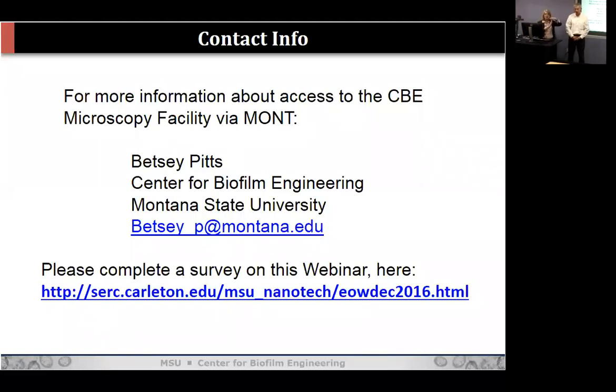Yes, absolutely. We have glycerin, oil, and water. In the inverted, they don't go right into the... No. Gravity always works that way. But we use such a tiny amount, everything is kind of a balancing act. So you don't have too much time to go in the Z direction? You do, you have quite a while. It depends on the medium. With oil or glycerin, you go easily like an hour.